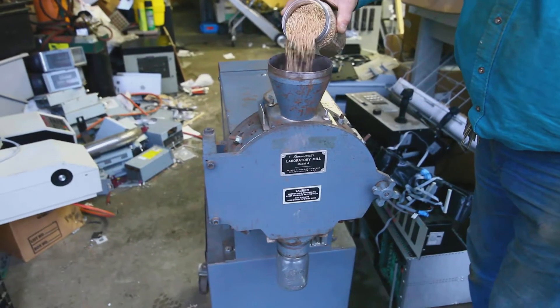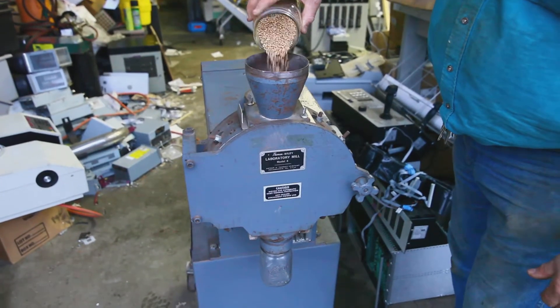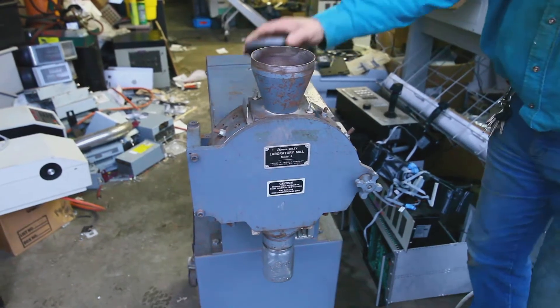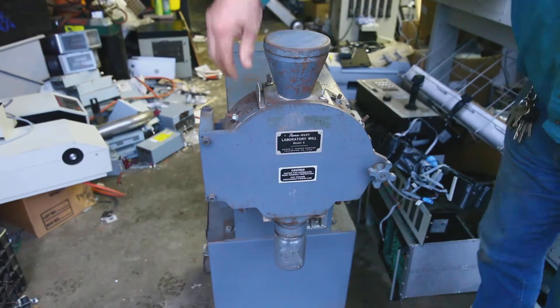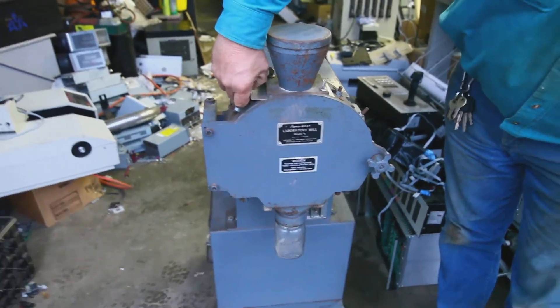Now we're going to do a test of grinding some wheat. Put the cap back on, start the mill, and start releasing the grain into the mill.